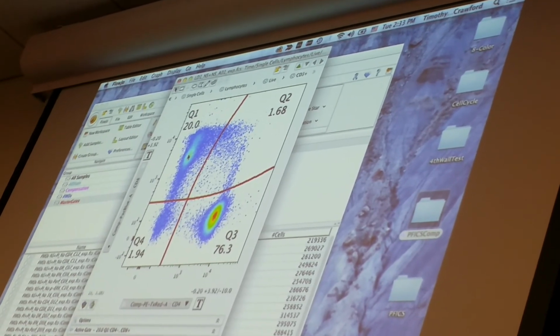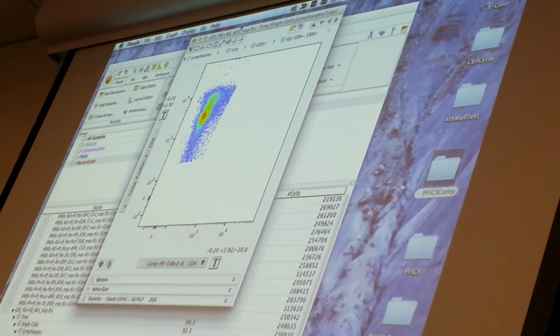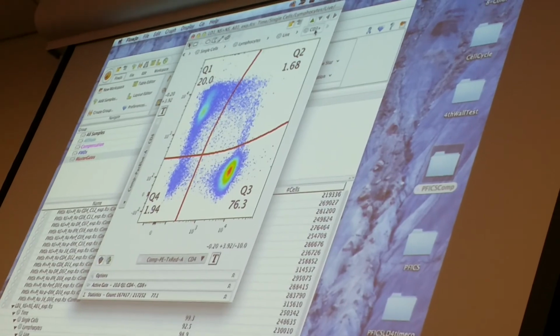And then I'm going to double click just on the top left CD8 positive single cells and take a look at my readouts. I'll point out here at this level that you can actually keep this same plot open and now move up the gating tree and see how your gating actually subset down to the population of interest. So if I go up to live cells, to lymphocytes, to single cells, to time, and to all state, you can see how my gates are subsequently reducing the number of events.